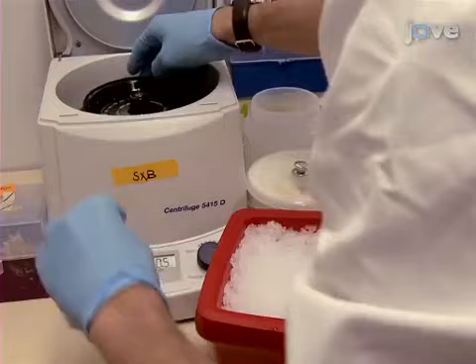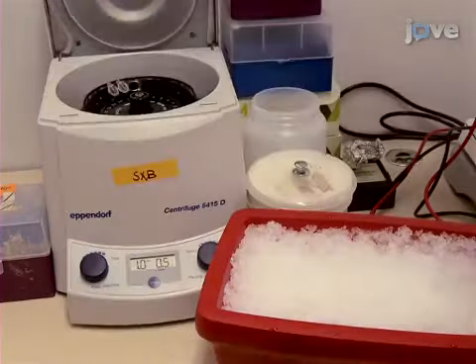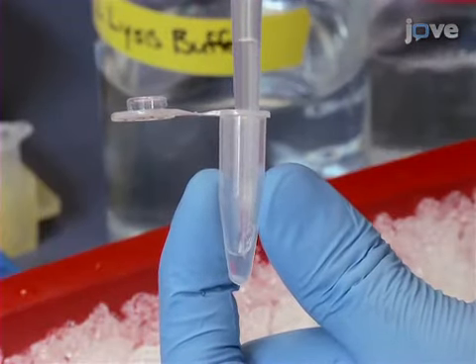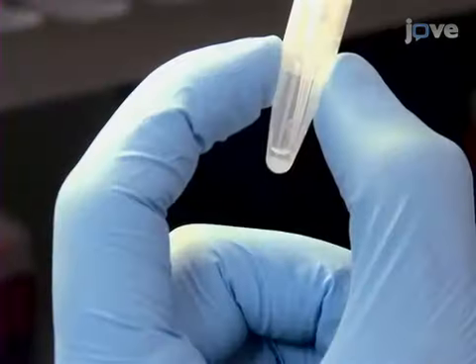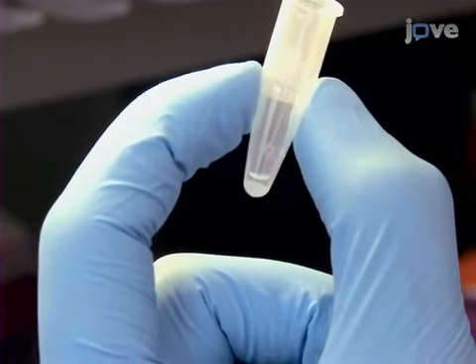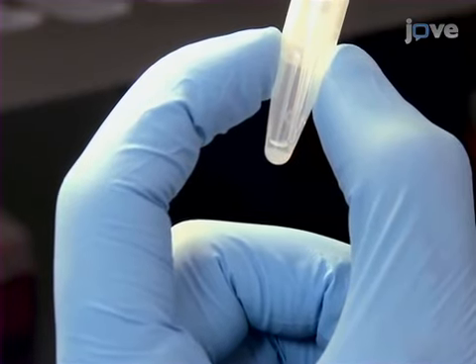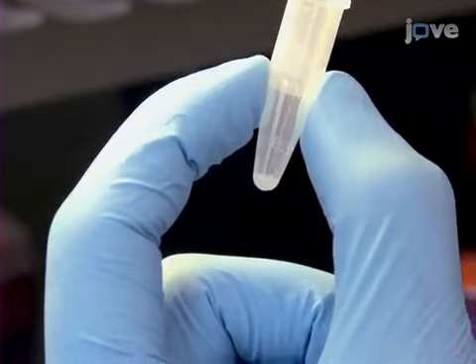Once biotin BMCC labeling is complete, gently wash the samples as described in the text. Remove the supernatant of the final wash, leaving the pelleted beads in a slurry with remaining buffer in the bottom of the tube. Dip a pipette with a small diameter tip into the very bottom of the tube through the slurry, and quickly collect any remaining buffer, being careful not to take up any beads.